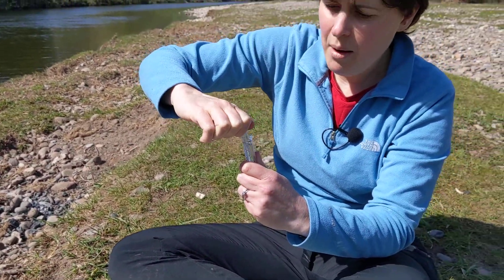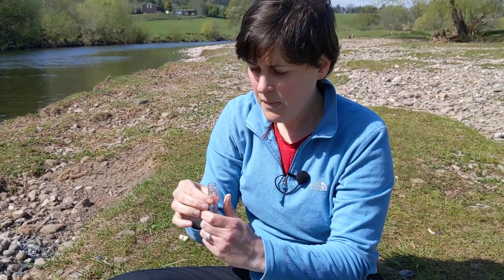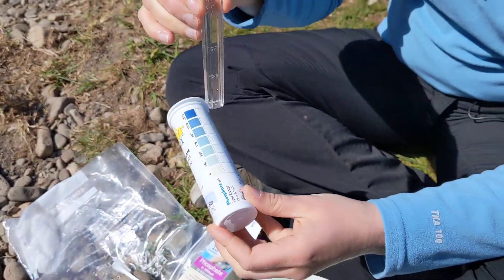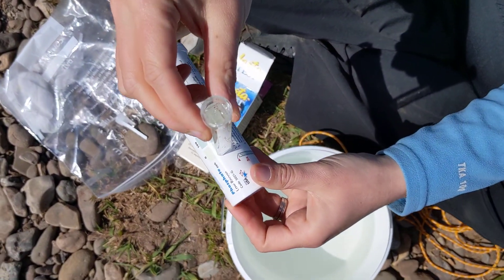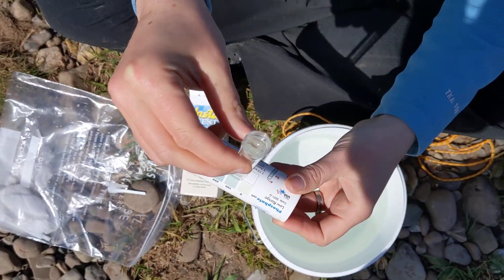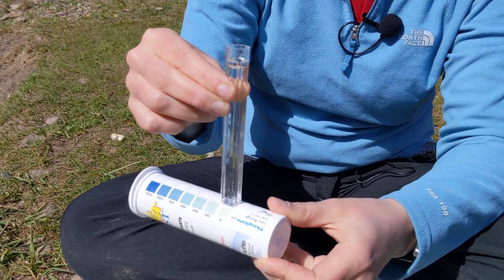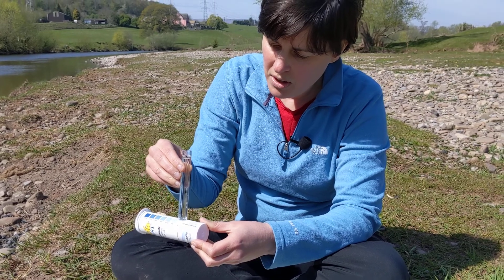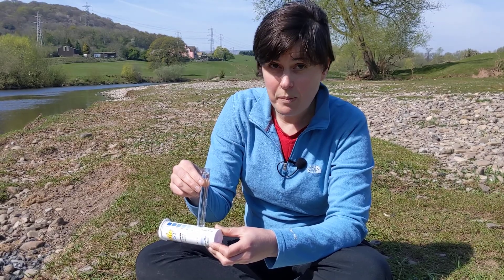Then remove the cap, put the strip to one side, and this is the tricky bit — you have to look through the sample down onto your test strip bottle and try to match the colour and see which one it matches closest to. Here there's barely been any colour change in my water and it doesn't look like it's gone very blue, so I think that gives me a reading of zero ppb, which is parts per billion.